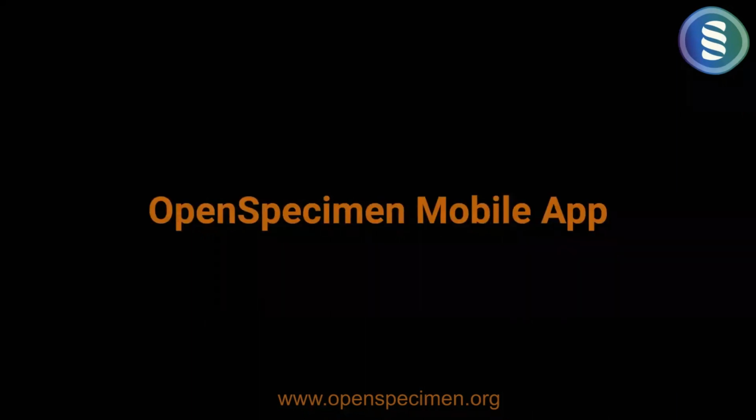With the context of the reasons to use the mobile app, and why it would be useful in a biobank, let's now look at what exactly we have done so far. Unfortunately, because of some technical glitches, I won't be able to do a live demo of the app, but I have enough material to show what we have done. If anyone is interested, we'll be happy to schedule a one-on-one demo where we configure the mobile app for their specific workflows and show them.